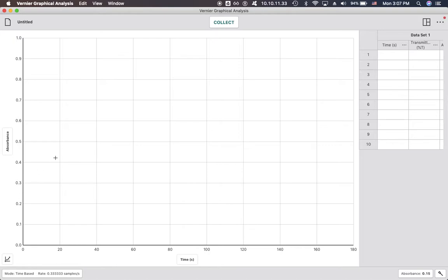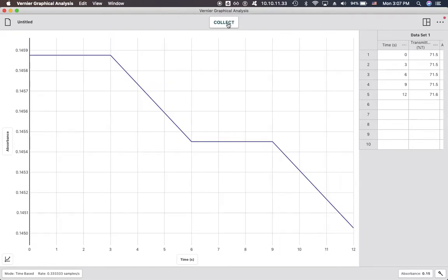Once you have that done, I'm going to collect data for just a short little bit of time. This data isn't going to make any sense because the colorimeter is empty, but we'll at least have a couple data points in the data set that we'll be able to use as we analyze this thing. Alright, that's about 10 seconds. That's enough. So we have 3 different columns here.